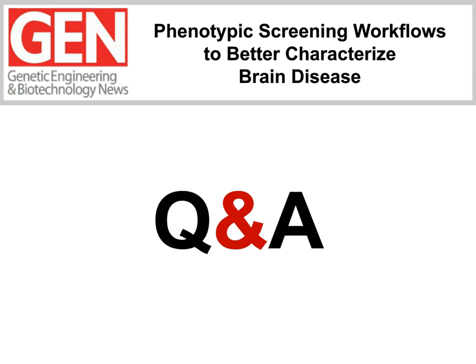All right, thank you very much, Dan. Satish, one of our audience members wants to know what instruments and software were used for the flow cytometry analysis. We used BD Biosciences flow cytometry machine and FlowJo software for analysis of the FACS data. All right, thank you, Satish. Dan, which software did you use to do the segmentation? All the segmentation that I presented was done with Columbus in server mode, so that's a PerkinElmer application for segmentation.